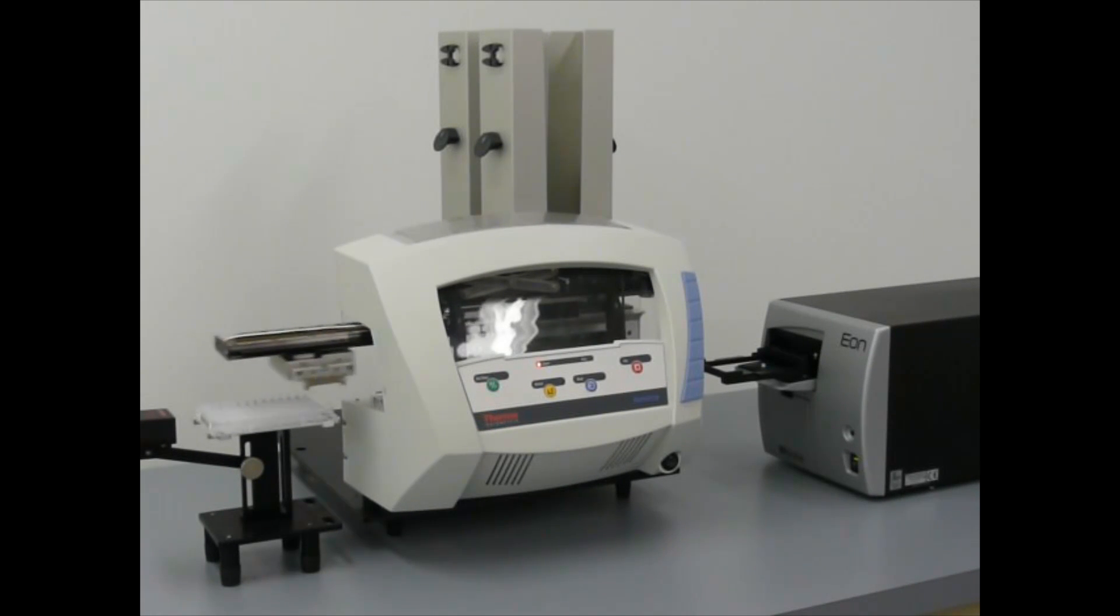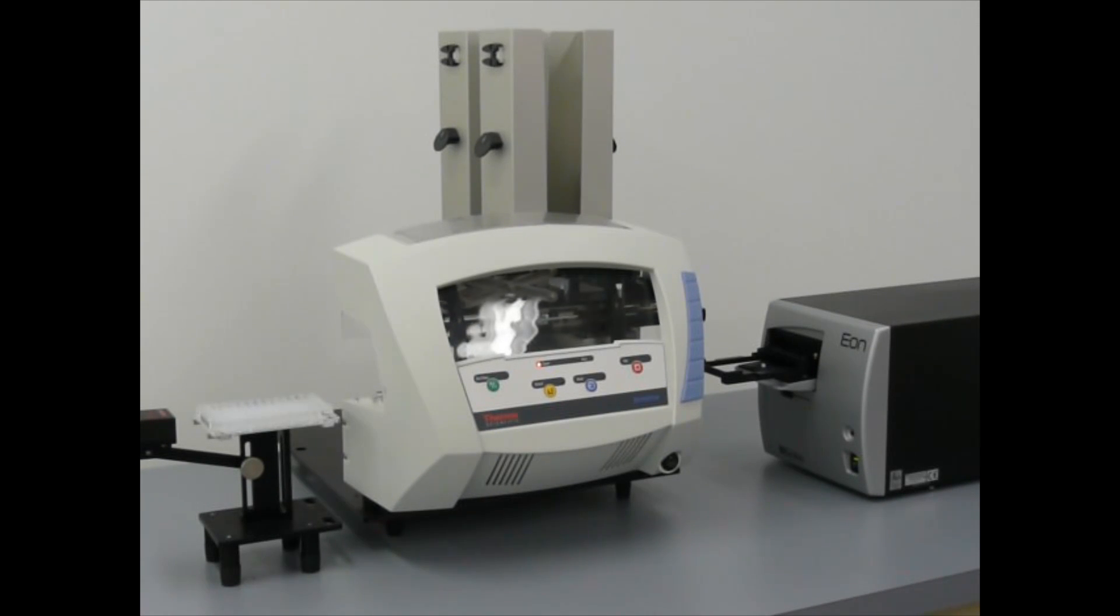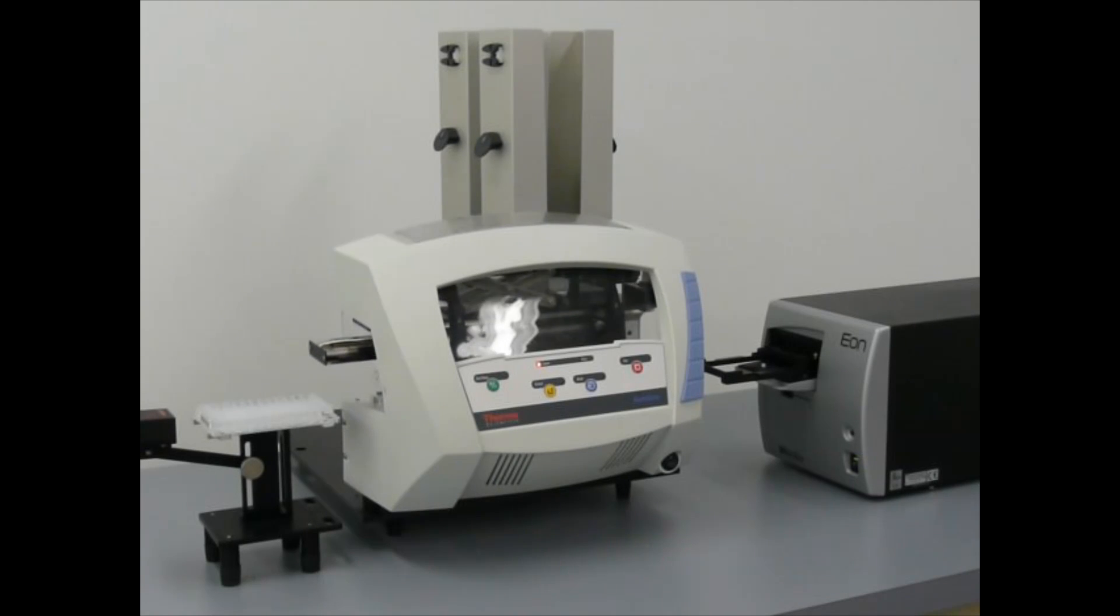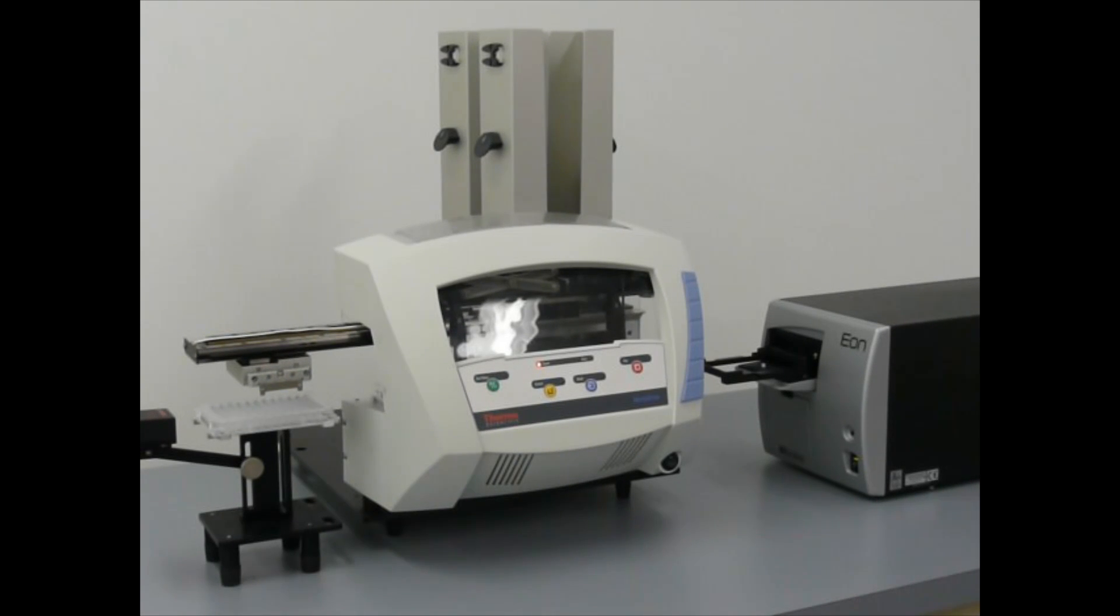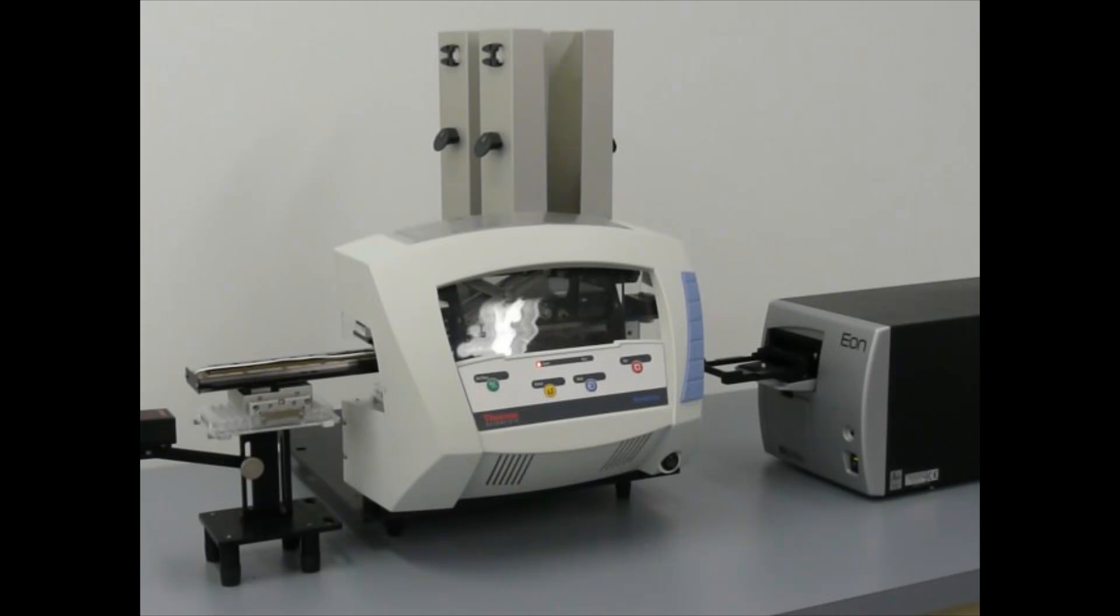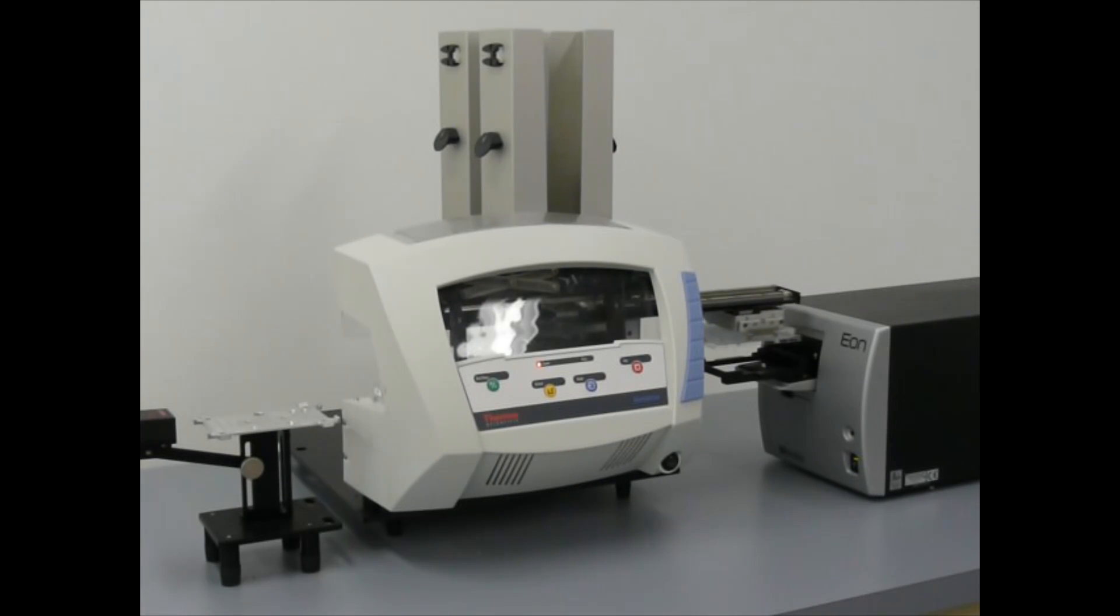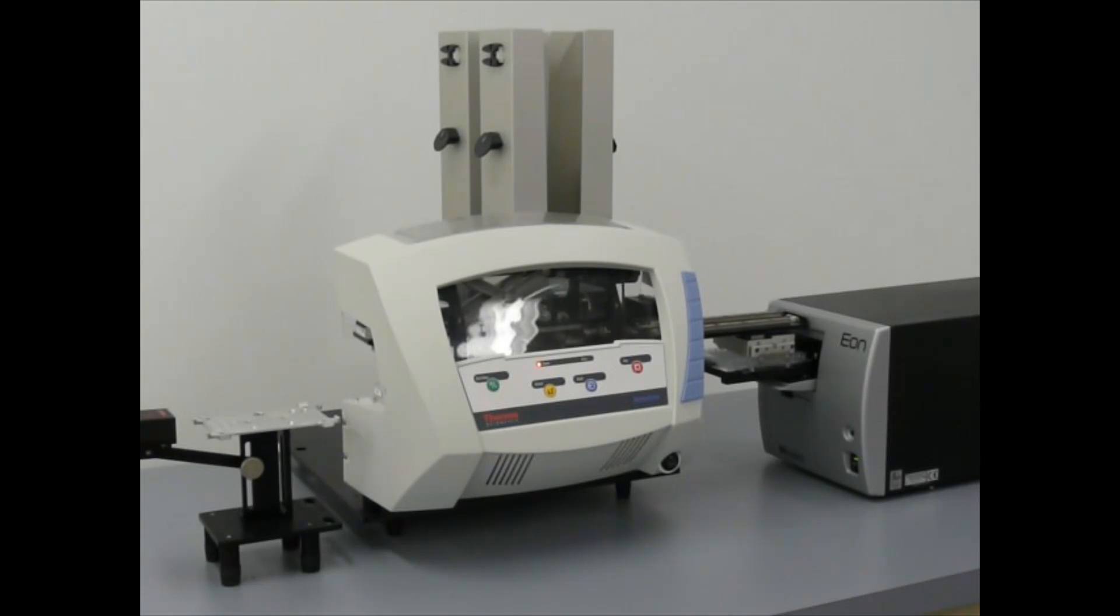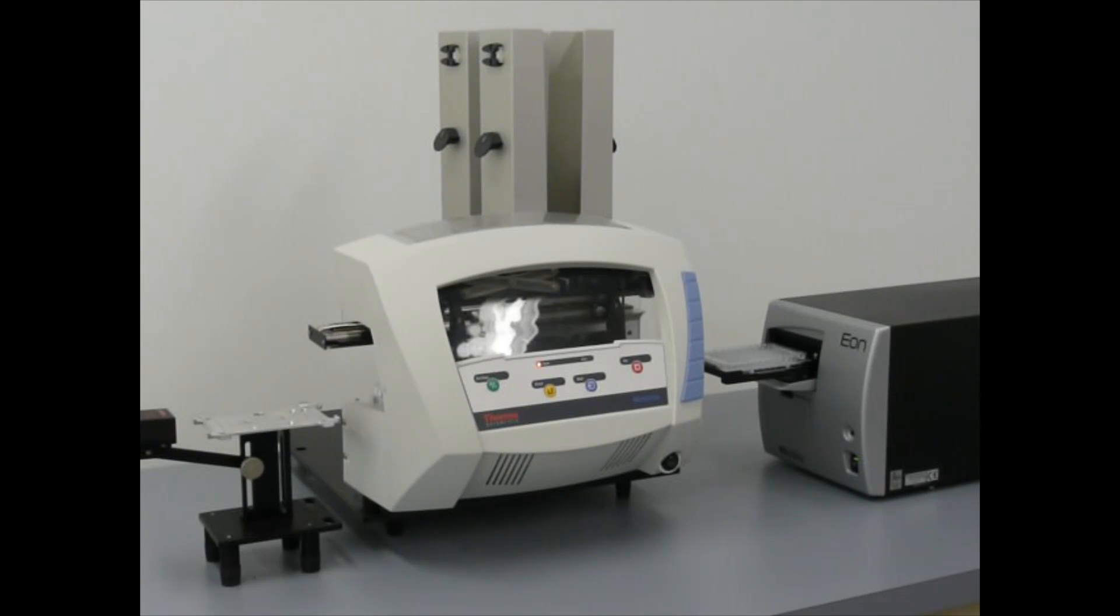The RapidStack Microplate Stacker operates easily and reliably with the Biotech Eon Reader. What's nice about this setup is that by adding a barcode reader on the left, you can add barcode data into the file name of each plate. Now this setup requires Biotech's Gen5 data analysis software.